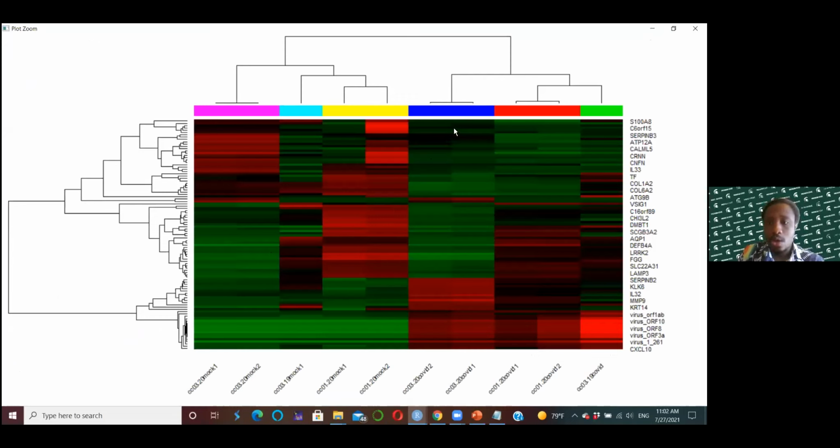Sorry. So now this heat map presents the various genes, right? And then they are grouped, or they are samples. So we have the 5 mocks, and then the 5 COVID. So these are the control, and then these are the experiments, right? And then how these various genes are expressed at each of these groups, right?